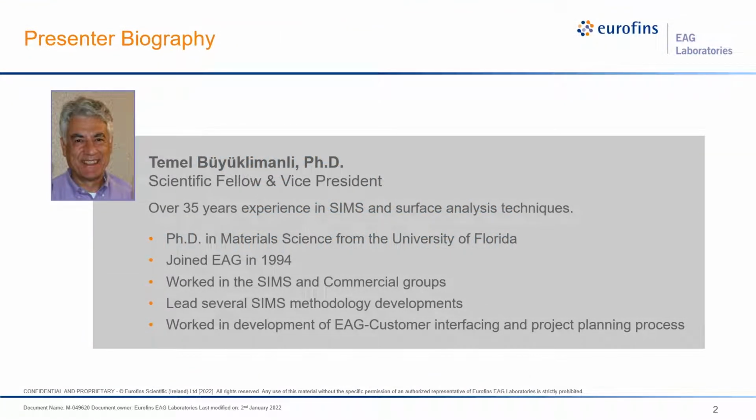I've been in the surface analysis field for over 35 years, which started with my graduate studies at University of Florida Materials Science. And since my start at EAG in 1994, roughly about 26 years ago, my focus has been on SIMS, and I participated in innovation of new SIMS methods over the years. Today, I will be showing you a few of those methods we developed being applied to glass surfaces and the coatings on glass.